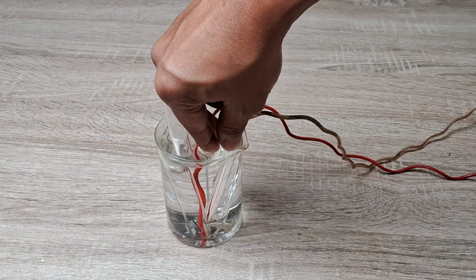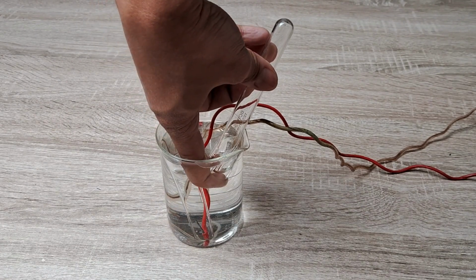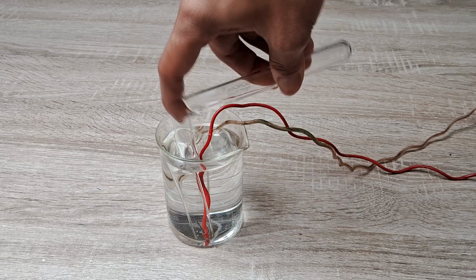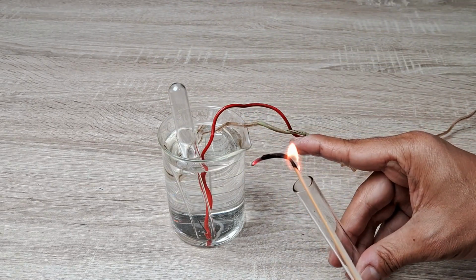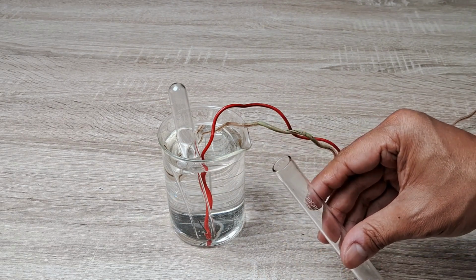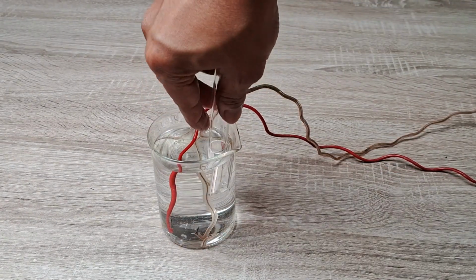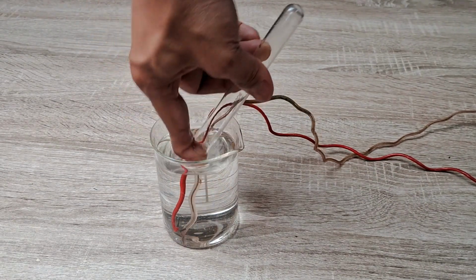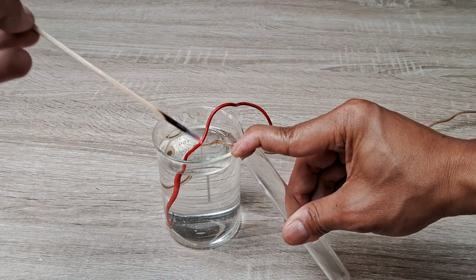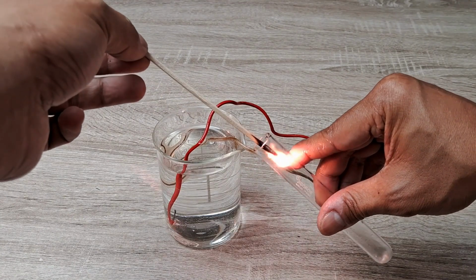First, remove the tube from the cathode terminal as it fills up first with the gas. Plugging the mouth with your thumb, remove the tube from the beaker and test the gas by introducing a burning splint into the mouth of the tube. You will observe that the gas ignites explosively with a characteristic pop sound. Do the same with the anode tube once it fills up completely with the gas. You will notice that when a glowing splint is introduced into the tube, the glow intensifies and may even reignite with a brilliant flame.